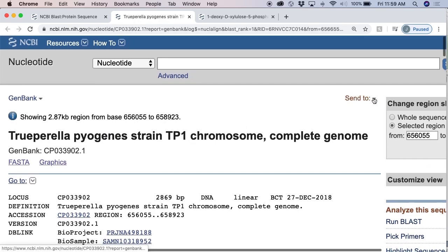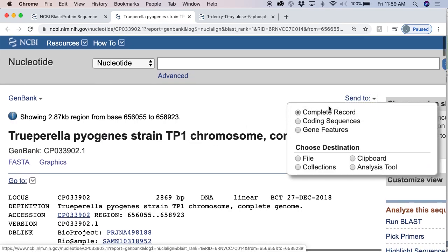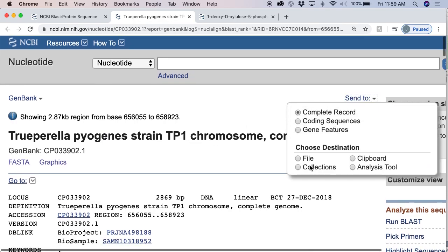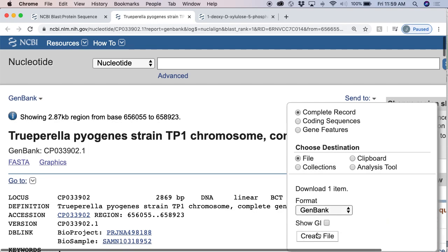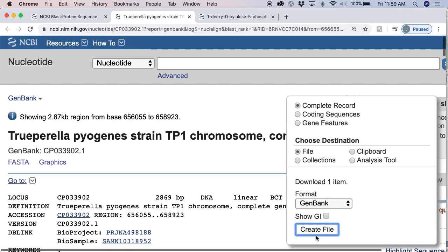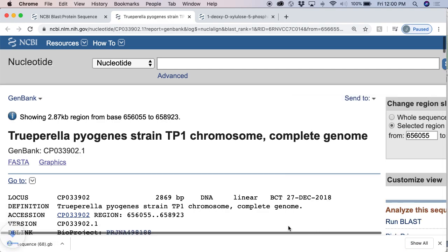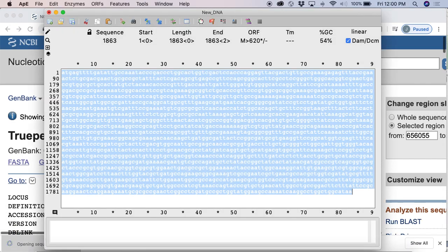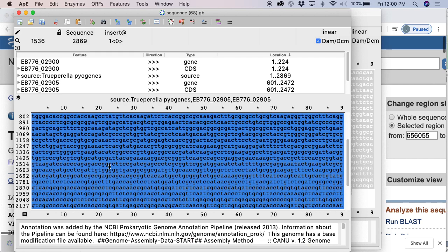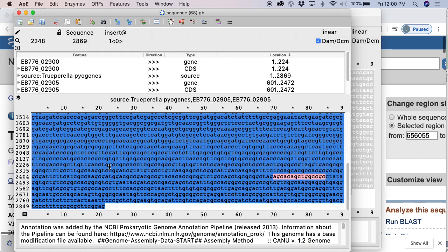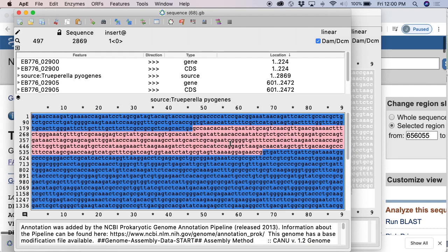We can now download this as a file. We want the complete record, we want a file, we want GenBank — create the file. Open it up and you can see there's that gene in the middle that's annotated. If you're unsure about what it is that is the sequence, you can always go back to where you were and then search for the sequence in there.